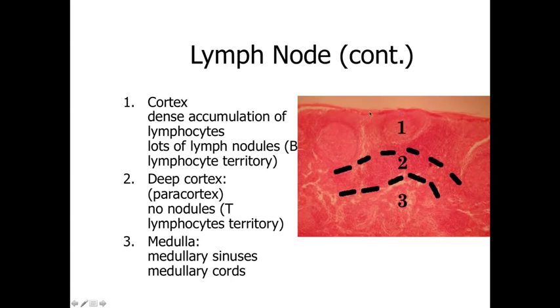Looking at the lymph node structure: we have the capsule around the outside. In the cortex, we're going to have lymph nodules — B lymphocyte territory, the cells capable of producing antibodies. We've got secondary lymph nodules with a germinal center and mantle around the outside, and lots of basophilic staining throughout the cortex. The deep cortex — sometimes called the paracortex — has no lymph nodules and is primarily T lymphocyte territory. So: B lymphocytes within the lymph nodules, T lymphocytes within the deep cortex or paracortex.